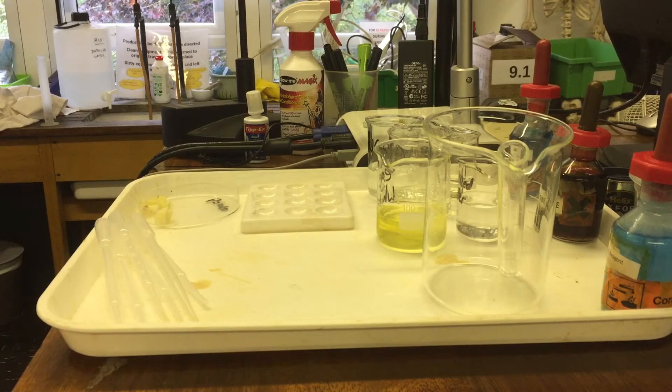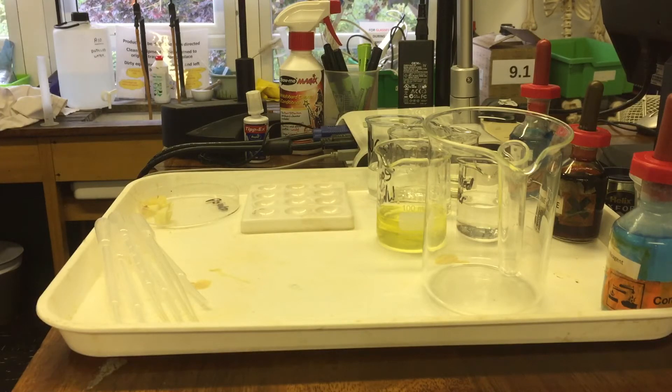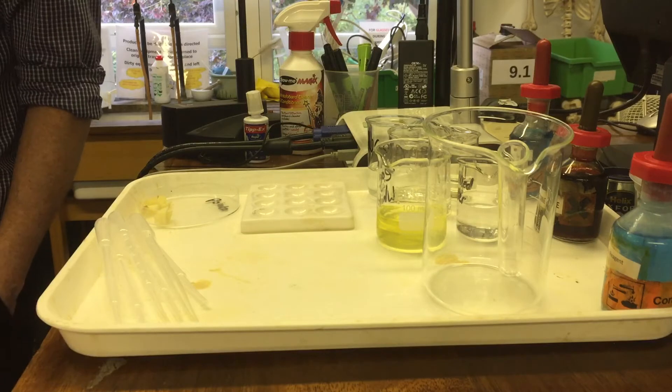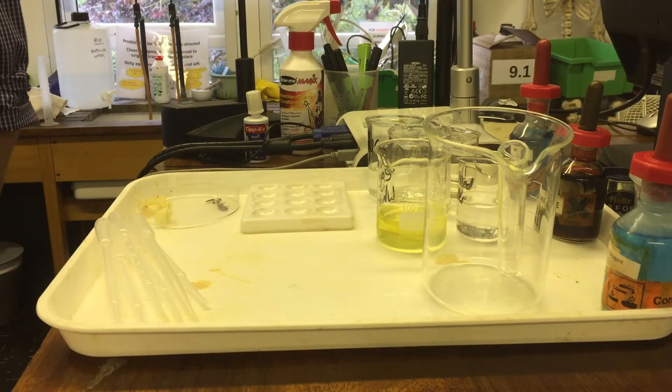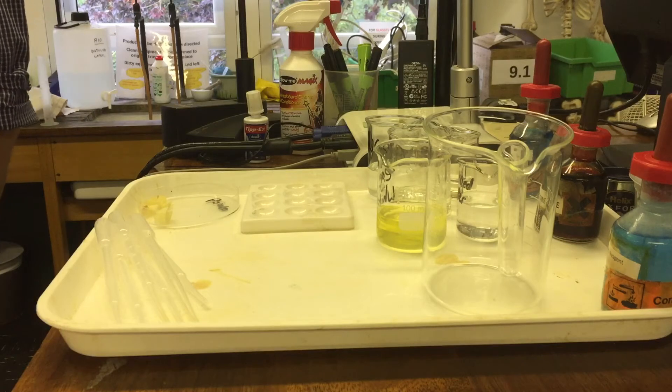The first one we're going to look at is the iodine test. Who can tell me what iodine tests for? Good, it tests for starch and starch is a complex carbohydrate. Can you tell me what we mean by complex carbohydrate, rather than a simple carbohydrate?